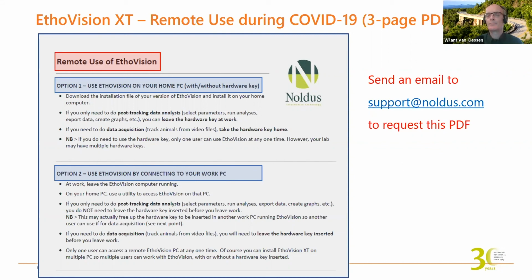But I also know that you can have multiple versions, and the software is not backwards compatible. So as long as you don't open up that experiment with the new version, you can continue to have experiments in version 13, say, while you're finishing up a project. And then a lab mate can be running a new experiment with version 15 without any issues. That's right. Yeah, because some labs have multiple users, and you want to finish up a project in one version before you make the leap to the next one.